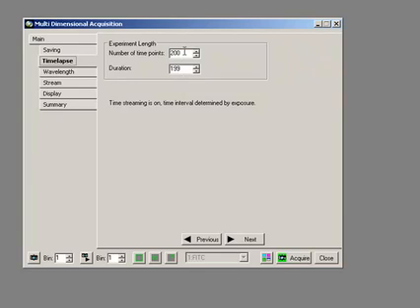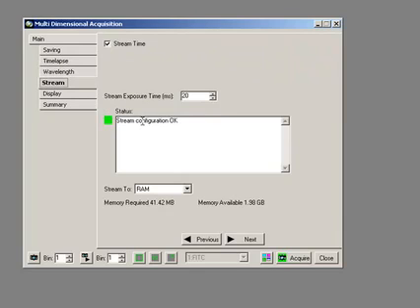At the moment we are using an exposure time of 20 milliseconds on a camera which has 10 frames a second. If I said I wanted to do 30 images, that's going to take me 3 seconds to stream, and that's going to go as quickly as it can to RAM or to hard disk. My time here is 20 milliseconds.